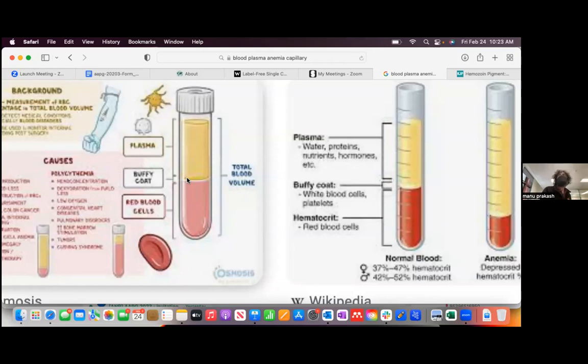So if you could isolate it and then run another session, one simple way of doing that is, if you want to stretch this in this axis, you can also use thinner and thinner capillaries, but then your centrifuges get bigger and bigger, right? Because centrifugation works on that principle where the distance from the rotation is what determines how much force that thing is experiencing. And so effectively, you could stretch it, taking it out. You could make it longer. Anything else? What else could you do if you want to stretch out the buffy coat, for example, here?